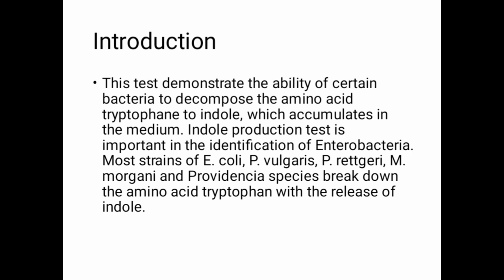and the indole production test is important in the identification of enterobacteria. So what type of bacteria are indole positive? They are enterobacteria, most strains of E. coli, P. vulgaris, P. rettgeri, Morganella, and Providencia species. They break down the amino acid tryptophan and release indole in the culture medium, where it builds up and accumulates.